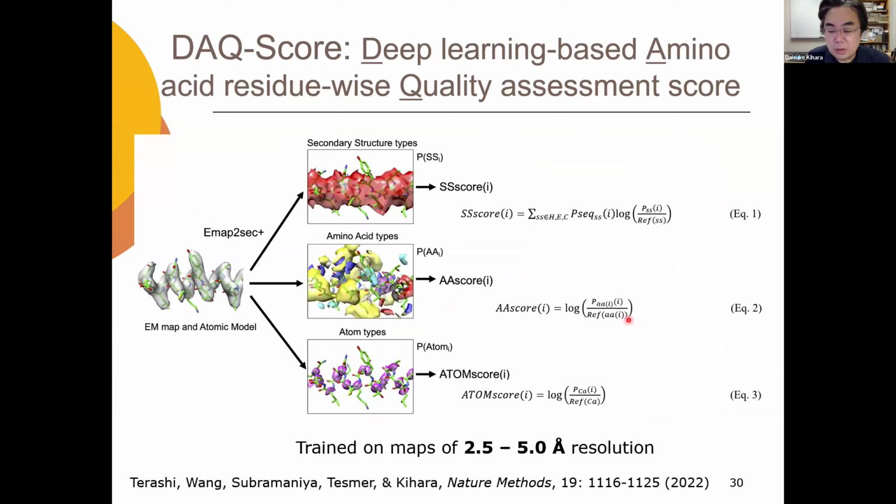So, all right. I have a couple more topics here. During the course of the development of DeepMainMast, we noticed that since structure modeling from a CryoEM map is not easy, even the published protein structures made available in PDB and EMDB are often not correct.